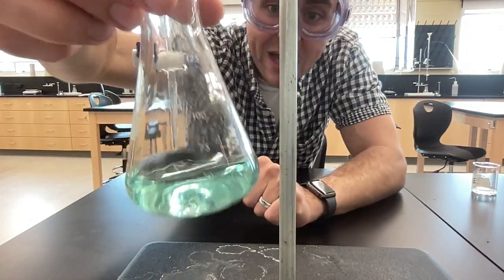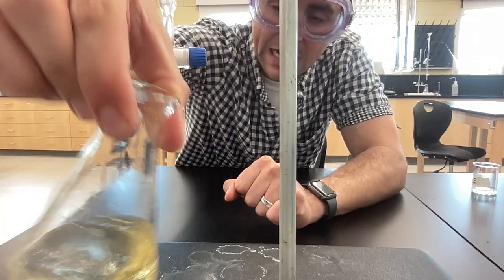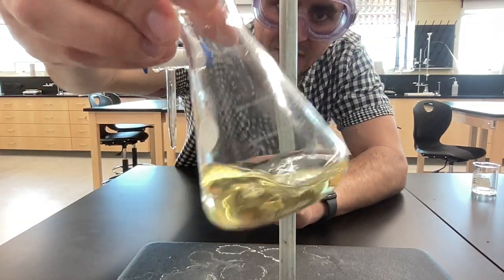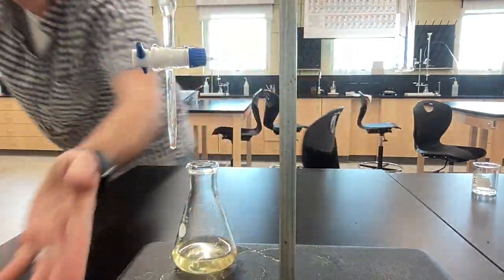Whoa, that's way better than last time. That's actually neutral. And now it's going yellow because I picked up some acid from the side. That's it. I mean, that's it. And what are we at? 20.1 milliliters, with my crappy measuring? Come on, folks. That's pretty good.